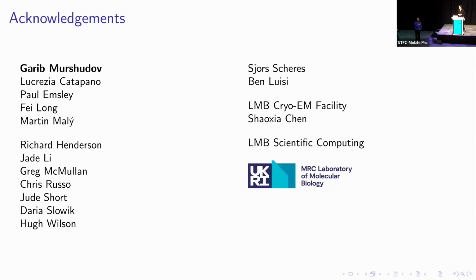Yeah, that makes sense. I have a question on Slack from Randy. It's asking if you could prune your larger training set to remove atoms from regions that have lower confidence in the fit or higher B factors. I didn't mention this, but we are doing this already. I'm filtering atoms with B factors higher than some threshold. Right, so they're already not included.